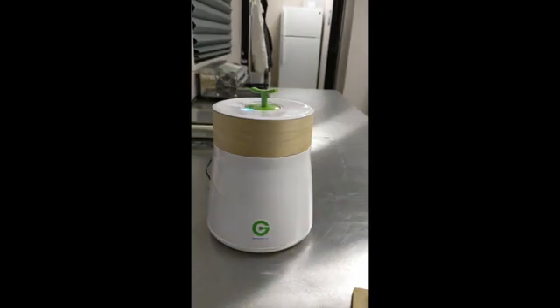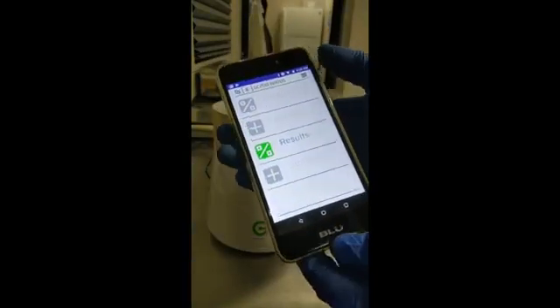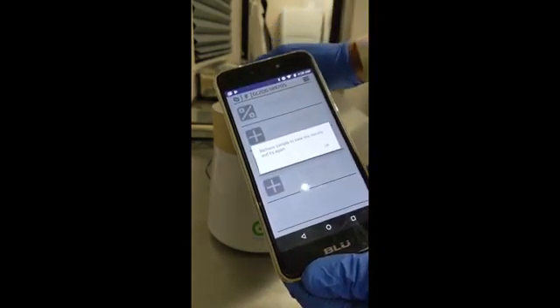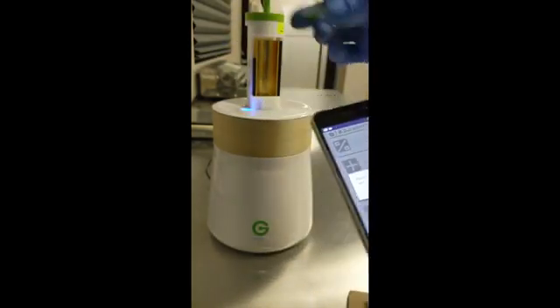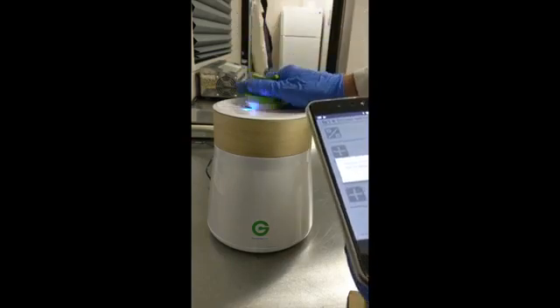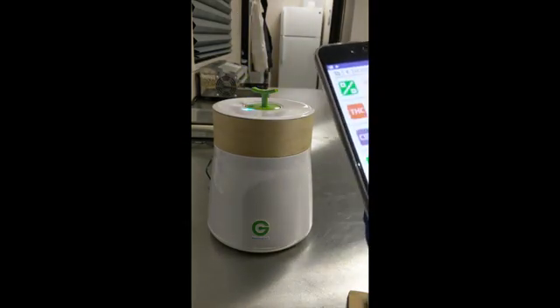After the testing is complete, you open up the app and go to the button that says results, and it asks you to remove the sample to view the results. You simply take it out, pull the little pen and pedestal off of the magnetic device, shut the drawer, hit OK, and hit results again.